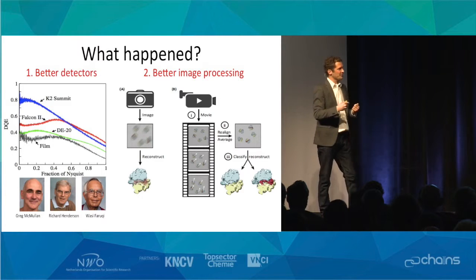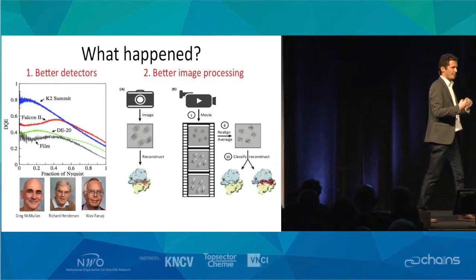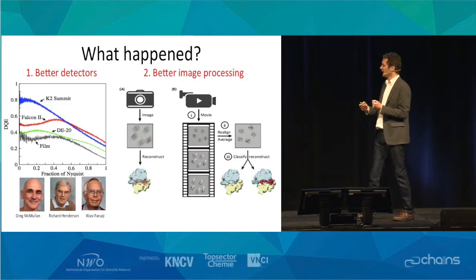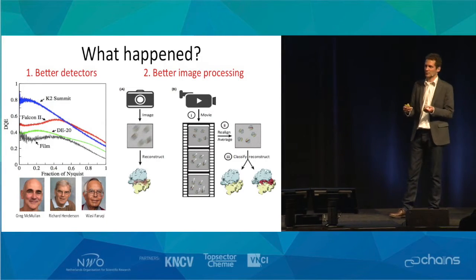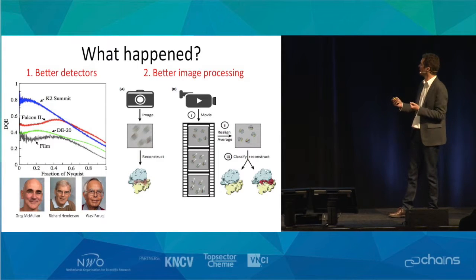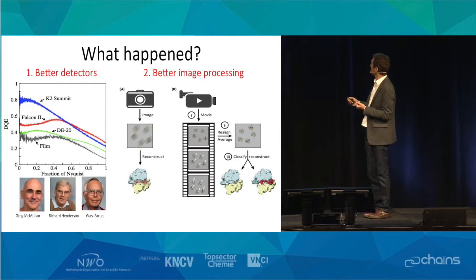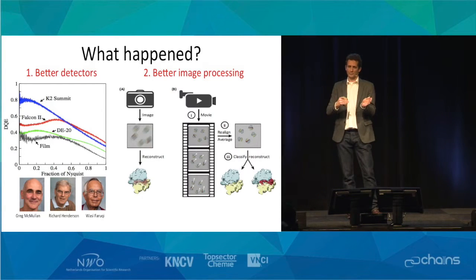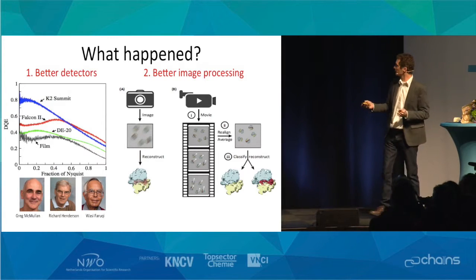So Richard, and then it was also followed up by others in the States, started to develop new digital detectors that can detect electrons directly. And this has recently led to the marketing by 3 different companies of direct electron detectors, which are digital chips. And the best ones are this Falcon and the K2. The Falcon is made across the road at FEI company, which used to be Philips. And they can now detect more or less 1 out of every 2 electrons. So we've gone from 1 out of 3 to 1 out of 2. But that has made a major improvement, as I will explain briefly.